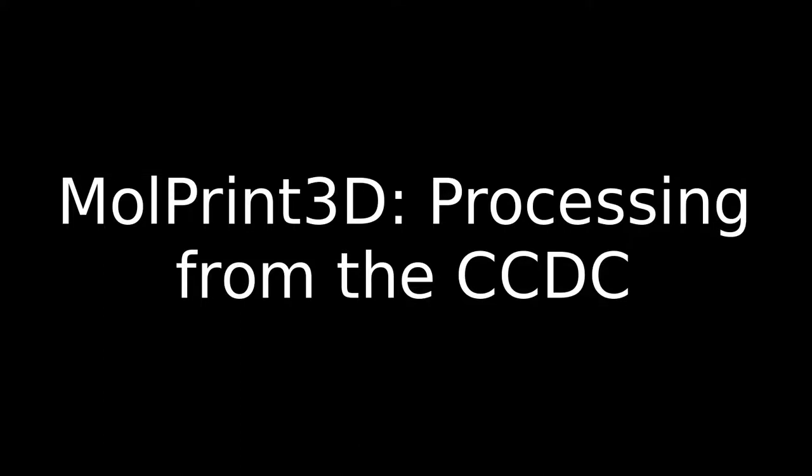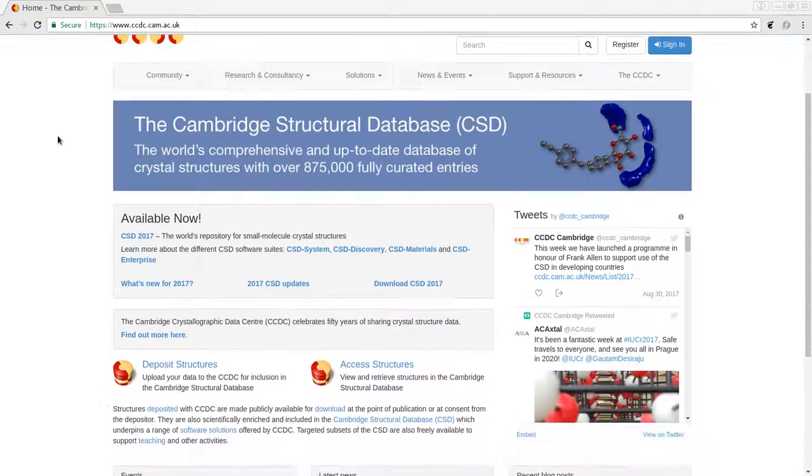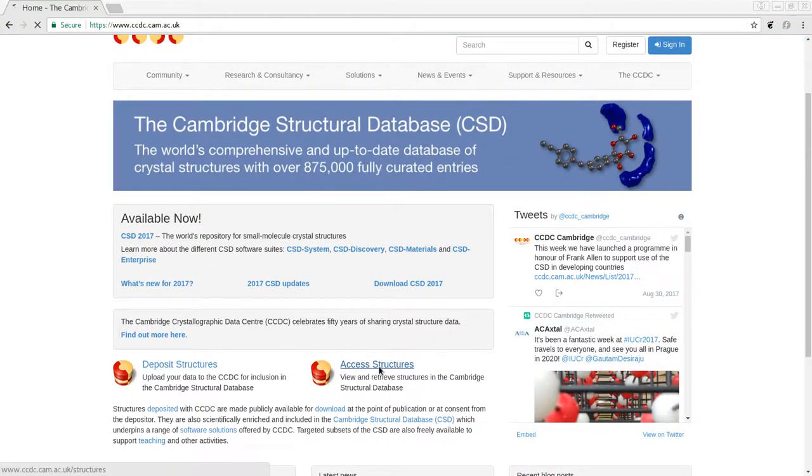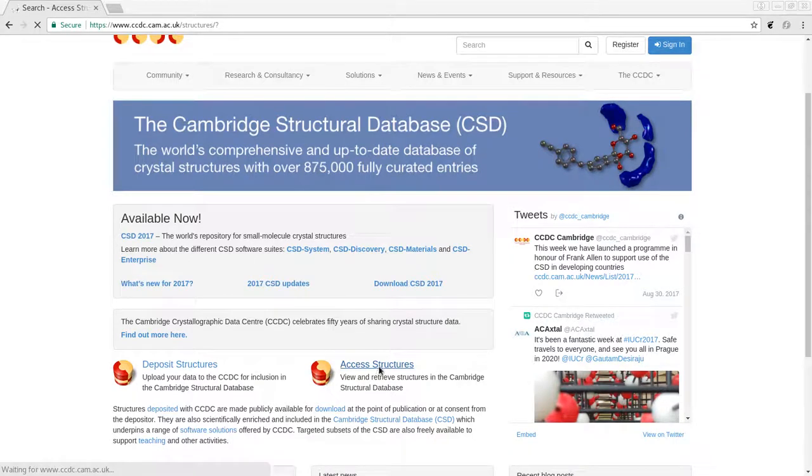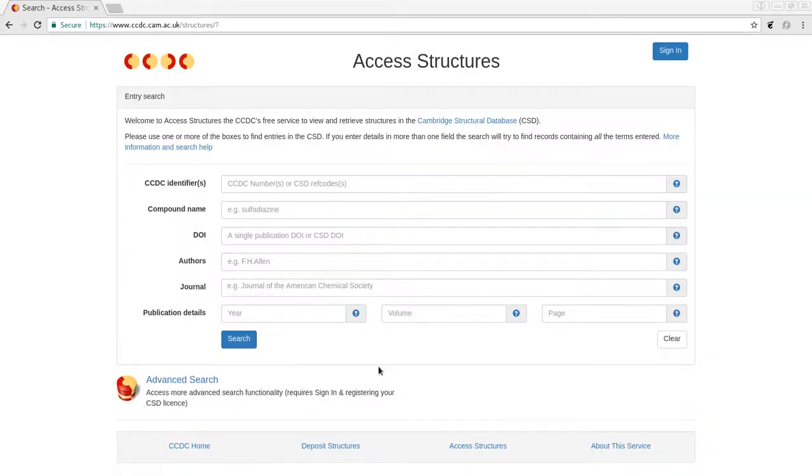In this video we'll look at how to generate VRLM files using the CCDC. We're going to access structures from the Cambridge Structural Database, and in this particular case we're just going to use the most simple example, the one that's given, sulfadiazing.